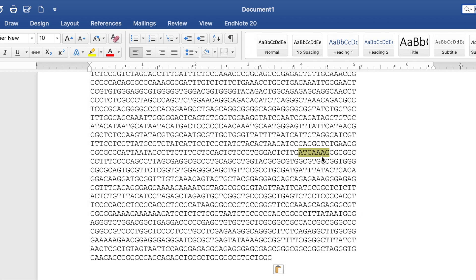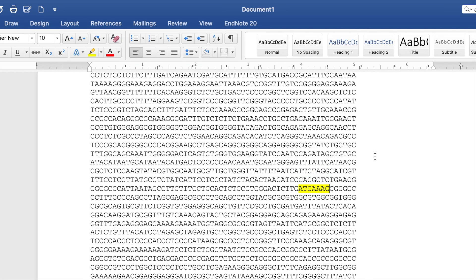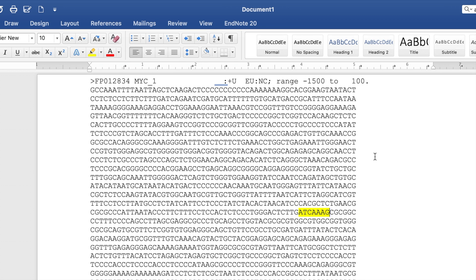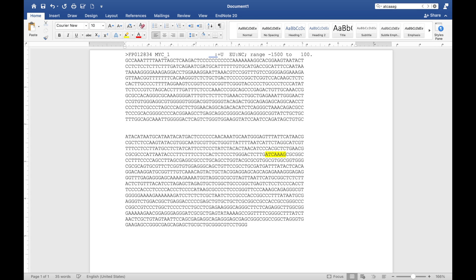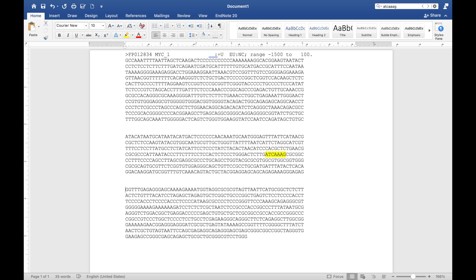Find the sequence specific to the LEF1 binding site. The next task is to design the forward and reverse primers flanking this specific sequence. To design primers for a real-time PCR, the amplicon size may need to be small. Therefore, let us select a small portion of the promoter sequence to design the primers that contain the specific LEF1 binding site.